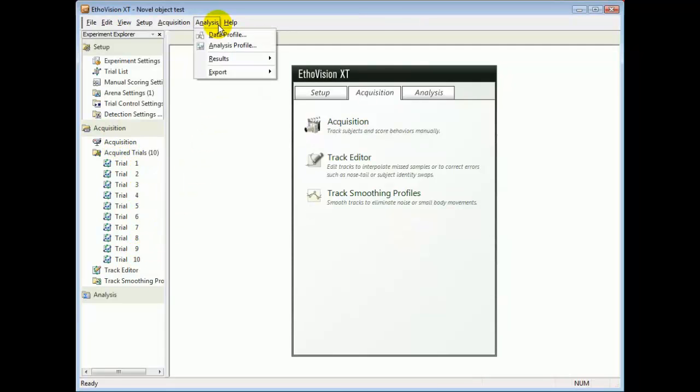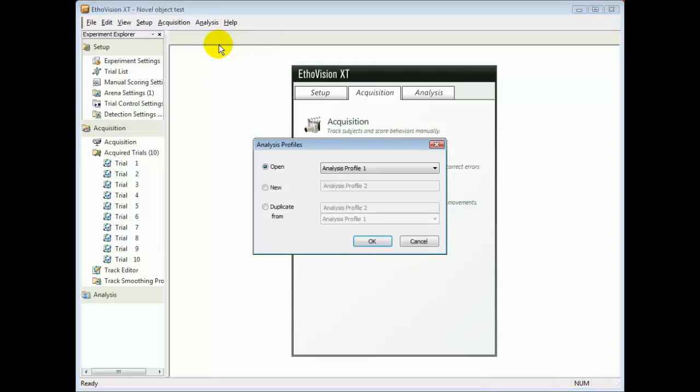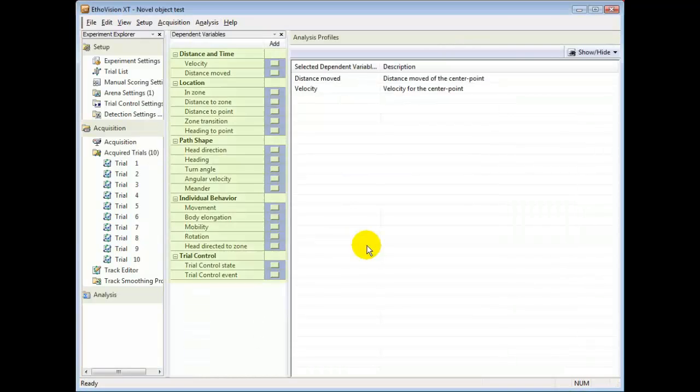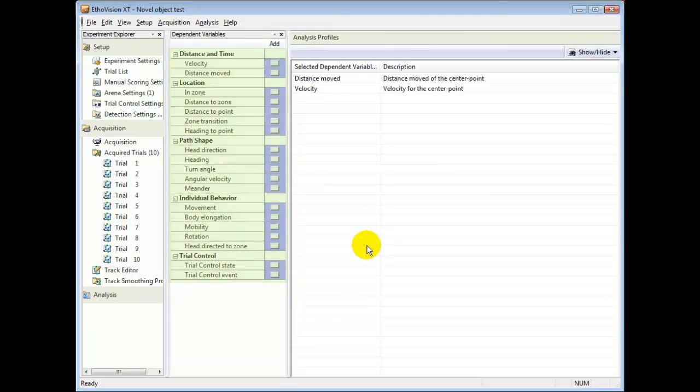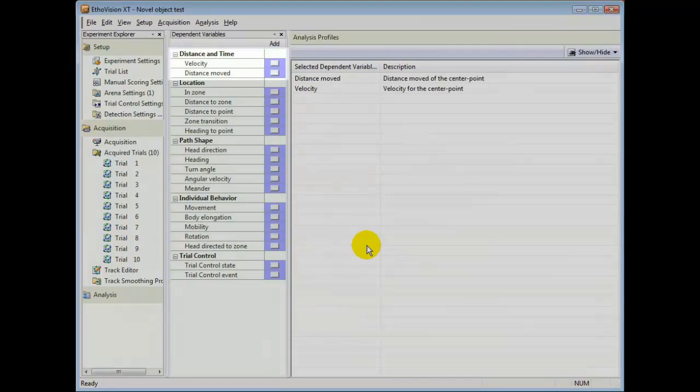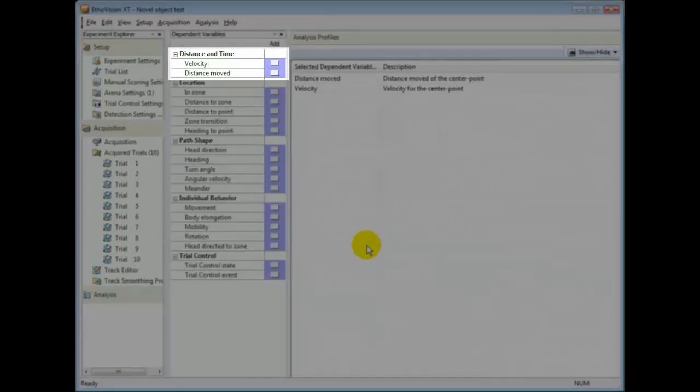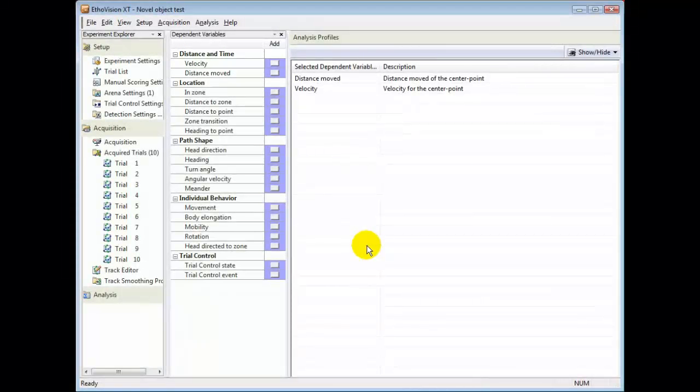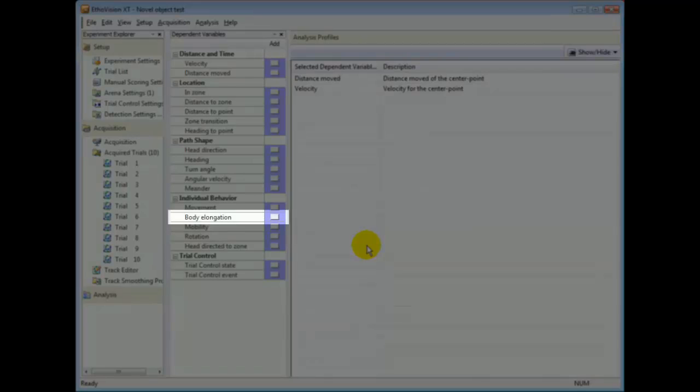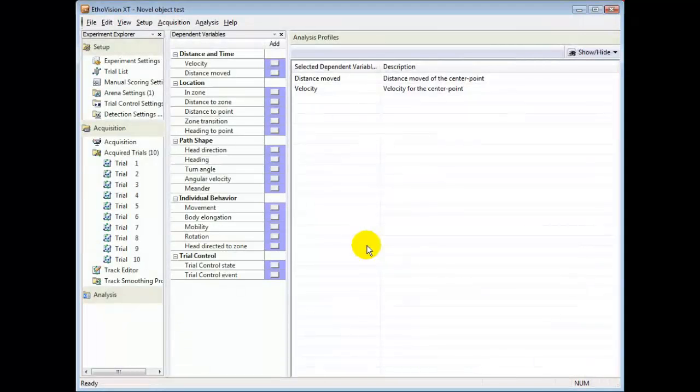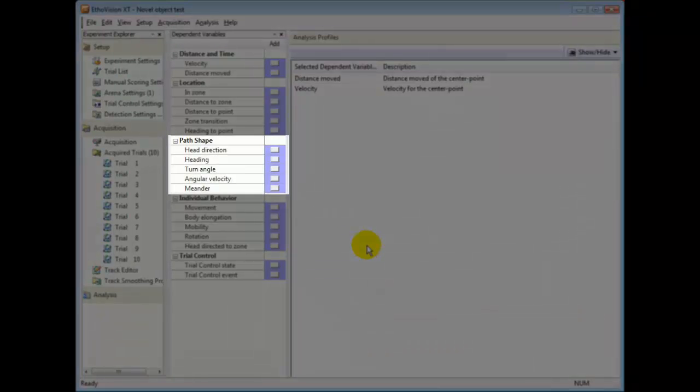I start by making a new analysis profile. A wide range of dependent variables are available to select for your profiles. For instance, you can quantify behaviors like activity with velocity or distance moved, stretch posture with elongation, and searching behavior with path shape.